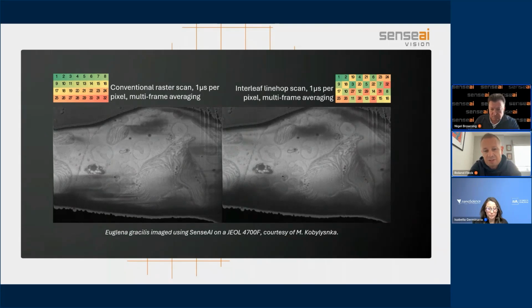This makes it much easier to interpret the data. If you're doing fluorescence CLEM, the fluorescence is preserved. You can identify regions of interest for targeting, for sectioning. And in principle, you can do quantitative analysis on your data sets.